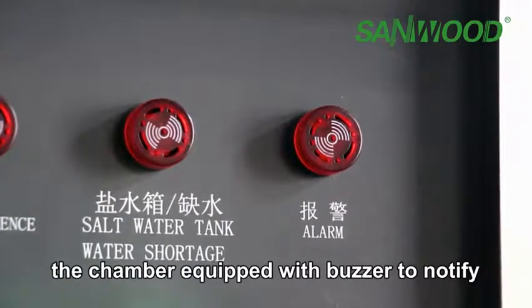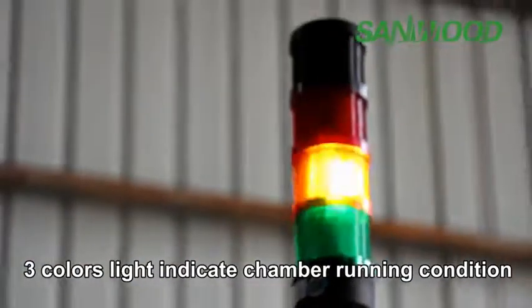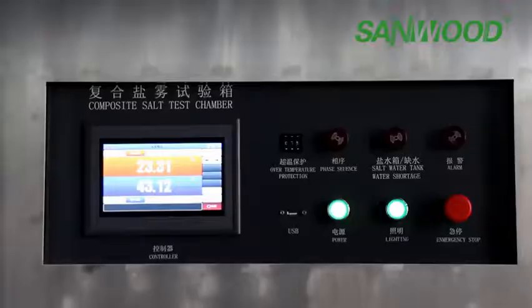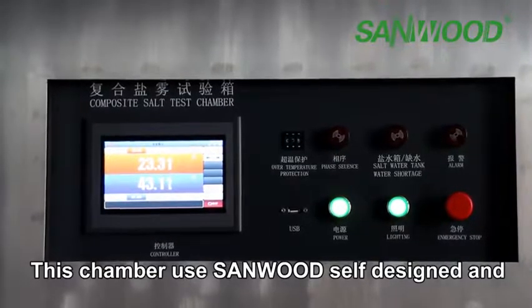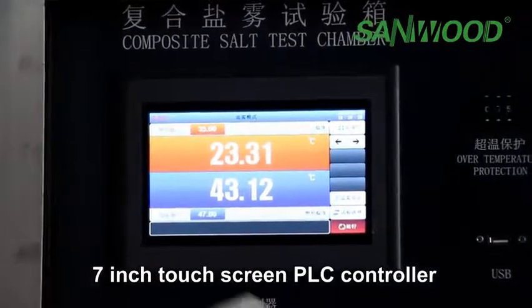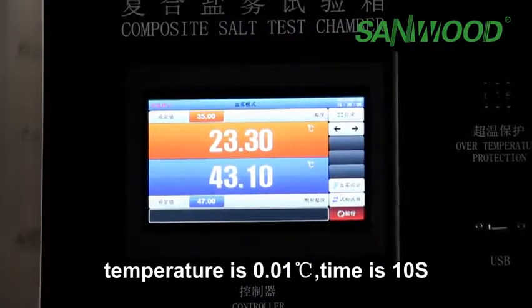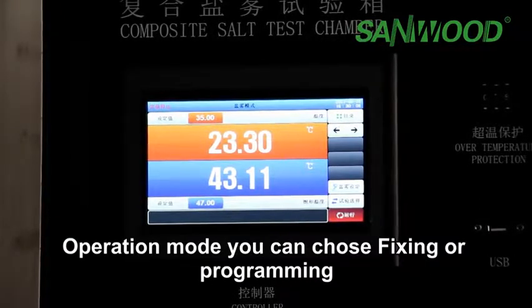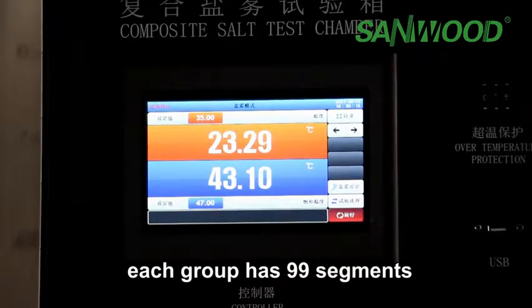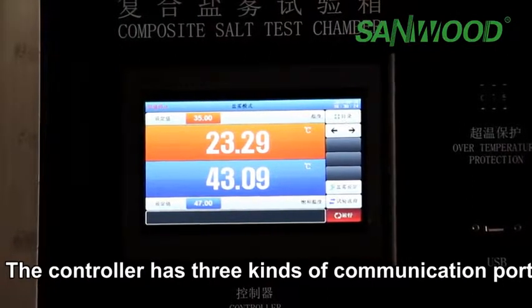The chamber is equipped with a buzzer to notify the user about any failure. Three color indicator lights show the chamber's running condition. This chamber uses SANWOOD's self-designed and developed controller with features including: a 7-inch touch screen PLC controller, temperature display resolution of 0.01 degrees, time resolution of 10 seconds, and operation modes of phasing or programming. You can set up to 120 program groups.